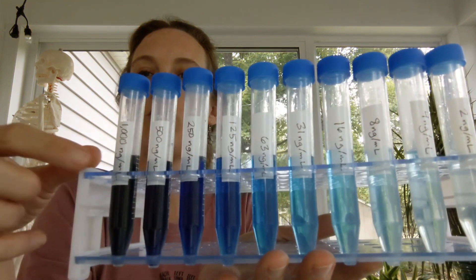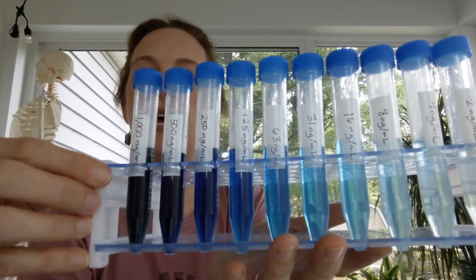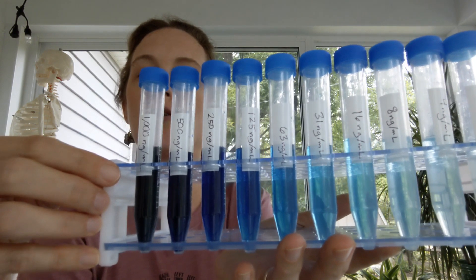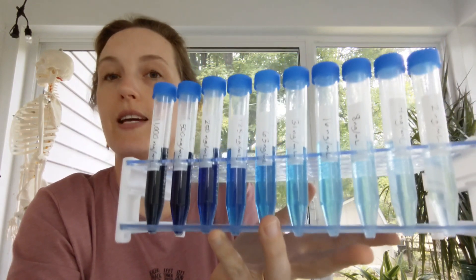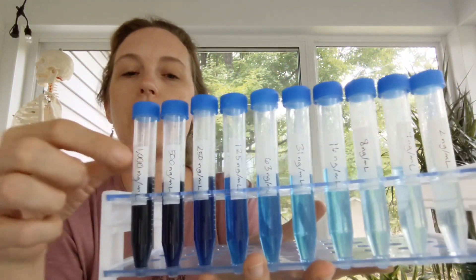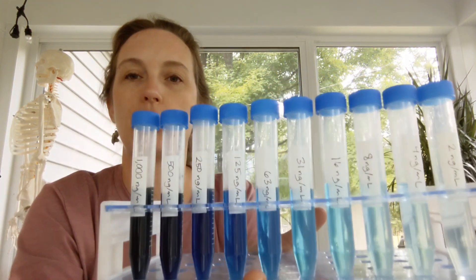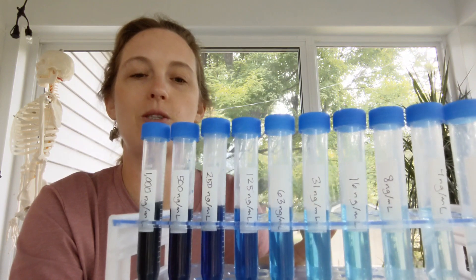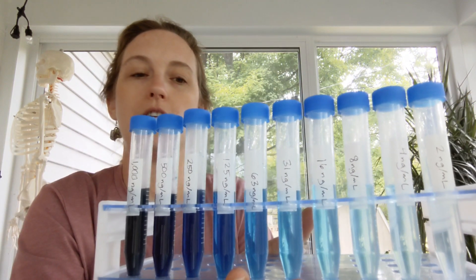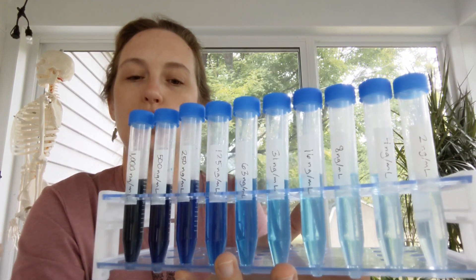I started with an imaginary value of 1,000 nanograms per milliliter of whatever the antigen is. We're doing an antigen ELISA, but you have to look at what your initial value is and then calculate your own serial dilution. So for my students, these are not the actual values. I'm just giving you an example, and you'll have to use the workbook and figure out the actual values of the dilution.